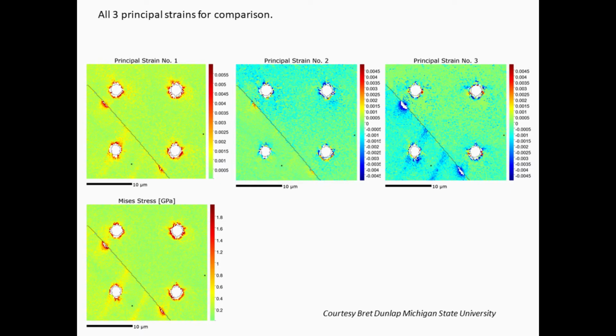It's what's going on at the grain boundary here. But you see, you've got energy build-up between this grain boundary and that indent, but nothing happening on the other side. And I find that very interesting.